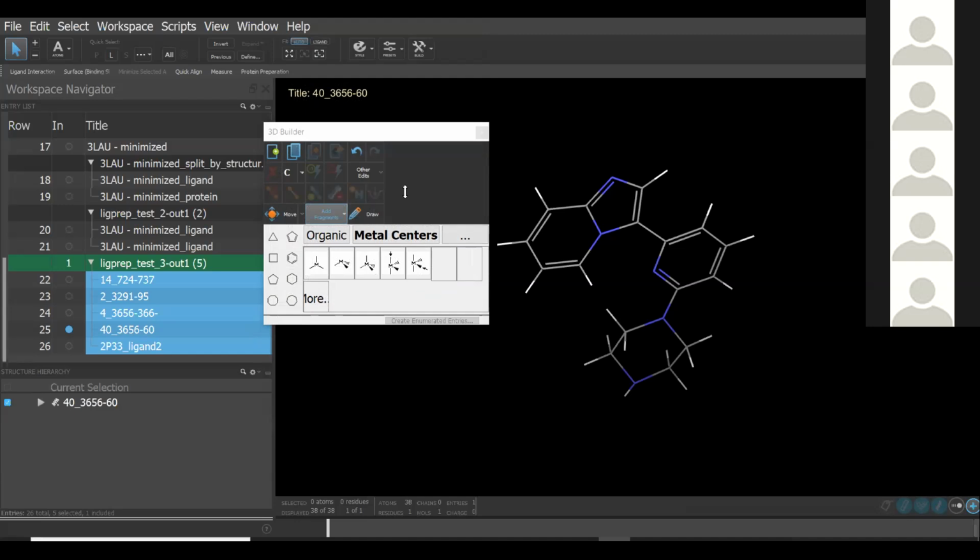One thing is ligands are always kept intact. The things that you remove are usually co-solvents. And co-solvents are different from the molecules that are important for the ligand interacting with your protein. So sometimes you might have water-mediated interactions, in which case you won't remove the water, but sometimes you also have glycerol molecules in your PDB, and you don't really need glycerol molecules for anything.